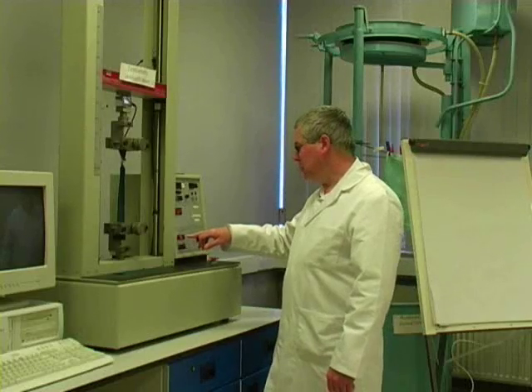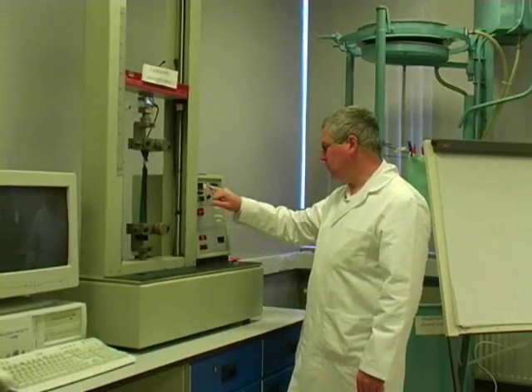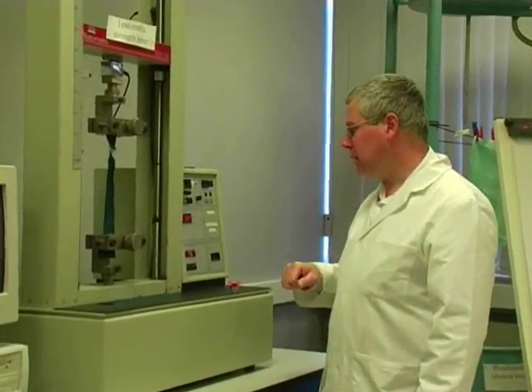That's the test done. That broke at a force of 88kg force with an extension of 58mm.